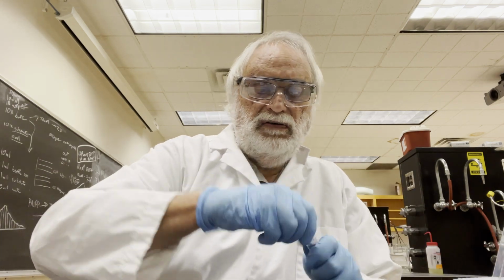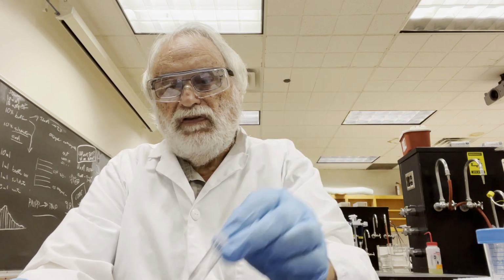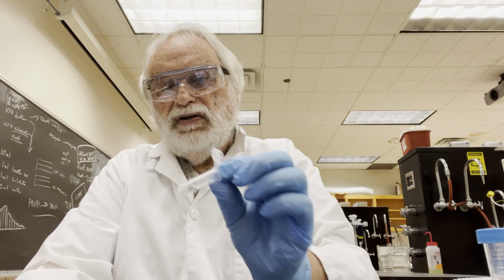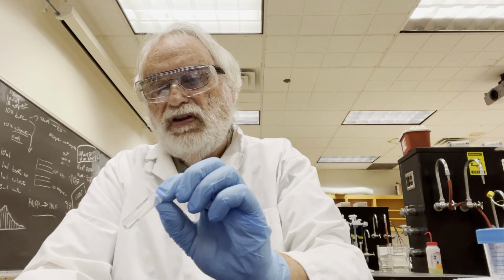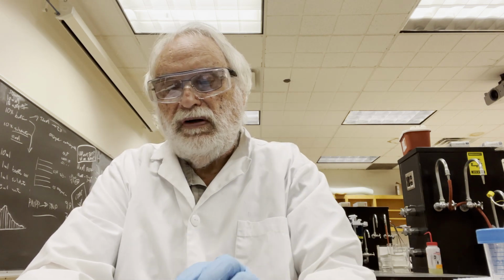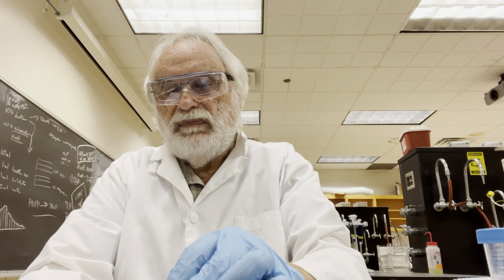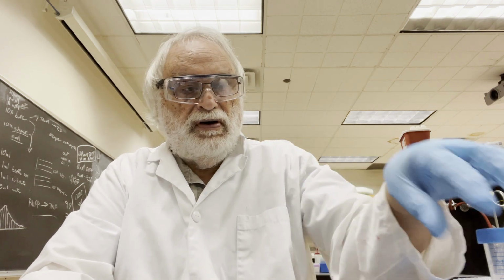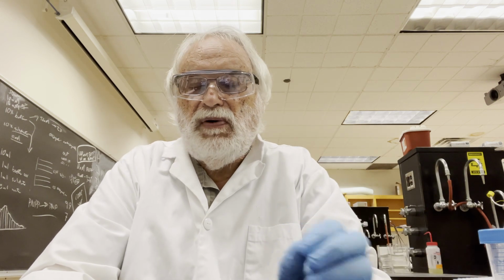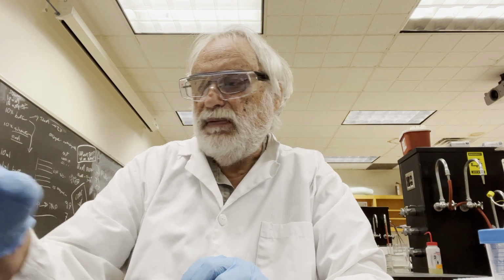What I have here are 4 tubes labeled 250 micromolar, 125 micromolar, 62.5 micromolar, and 31.25 micromolar. And I've added 7/10 of a milliliter of the assay buffer, which is 20 millimolar Tris pH 9 with 20 millimolar magnesium chloride present.